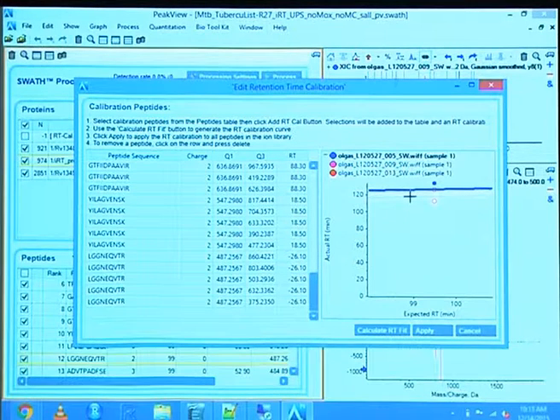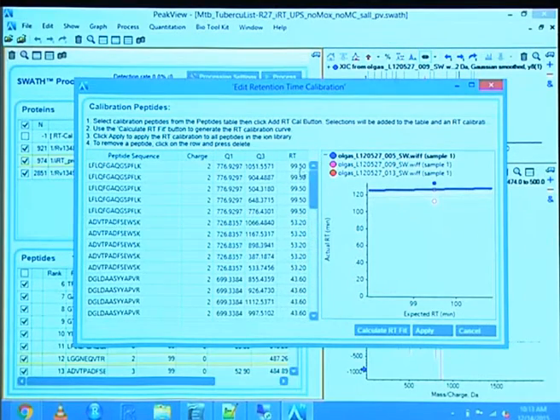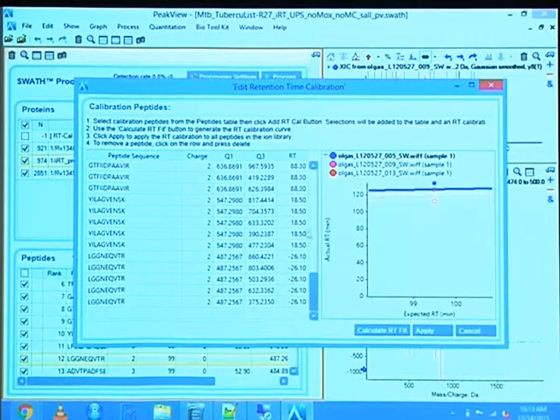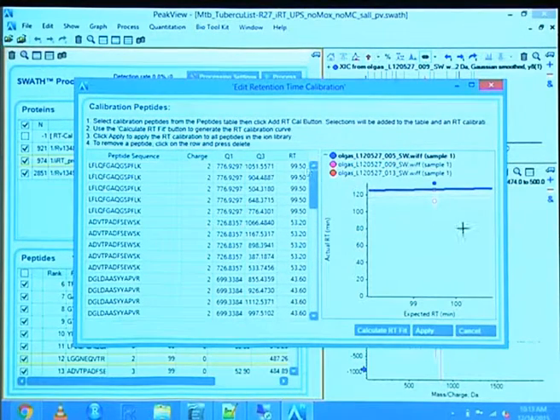And you see, do I only have one of them? Oh, damn. Oh, it doesn't matter. I thought I added the triply charged of that peptide as well. That's actually the more intense one, or the one that actually performs well. So in this case, you see here's some variation.